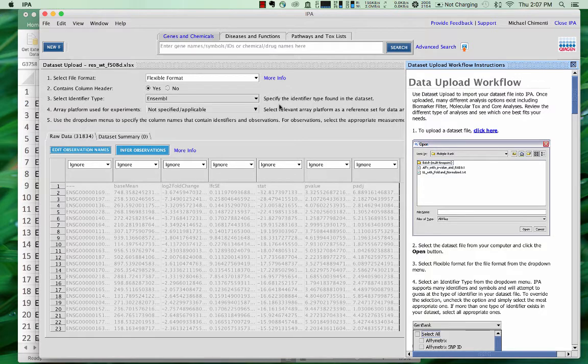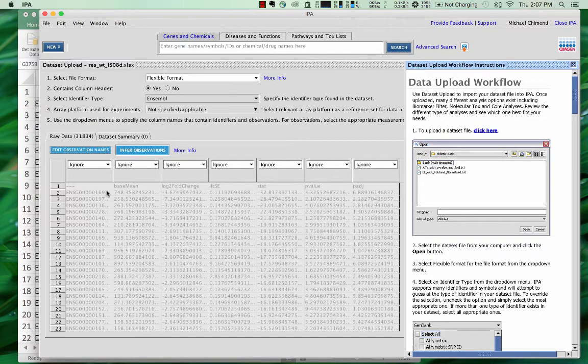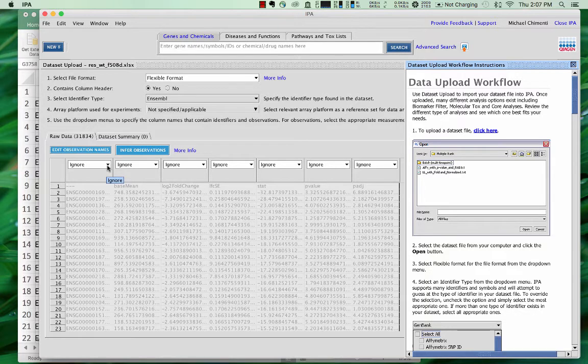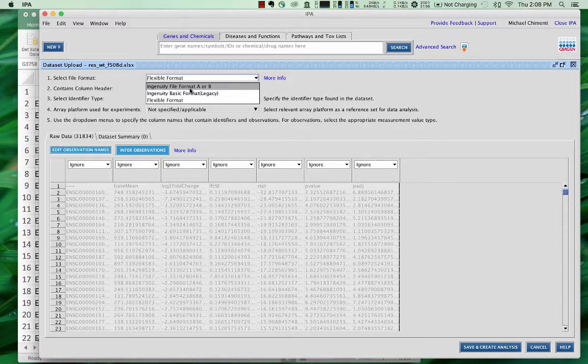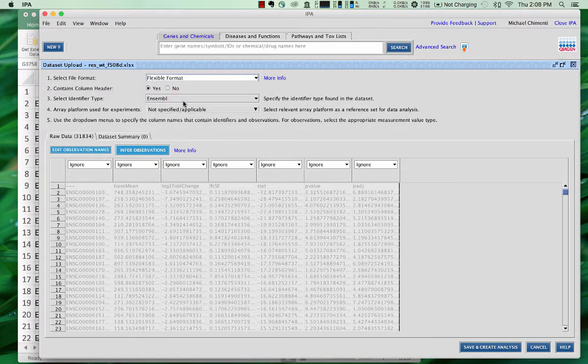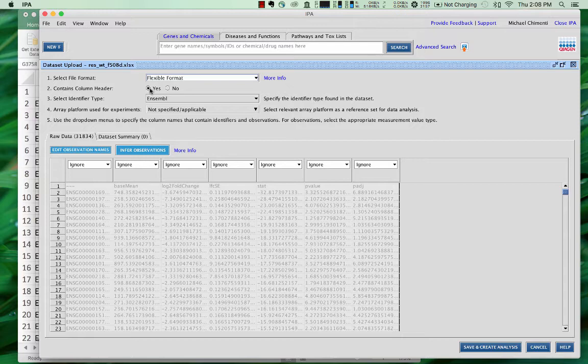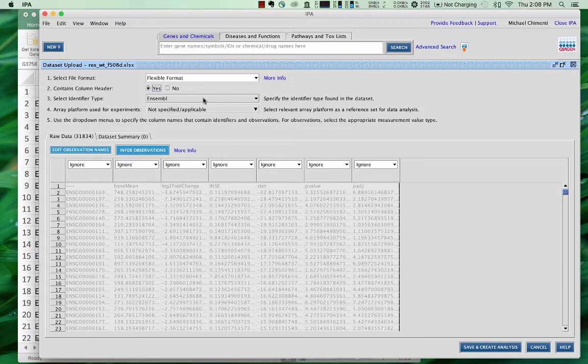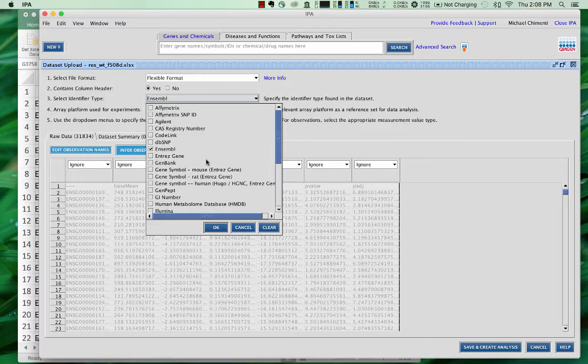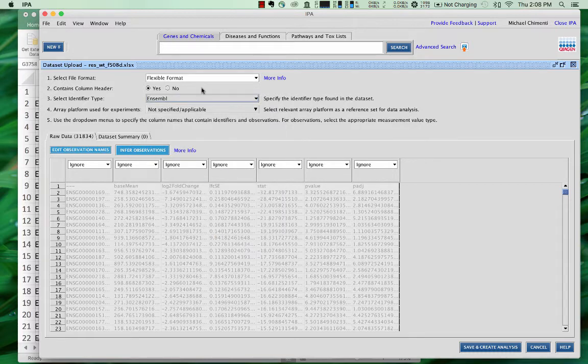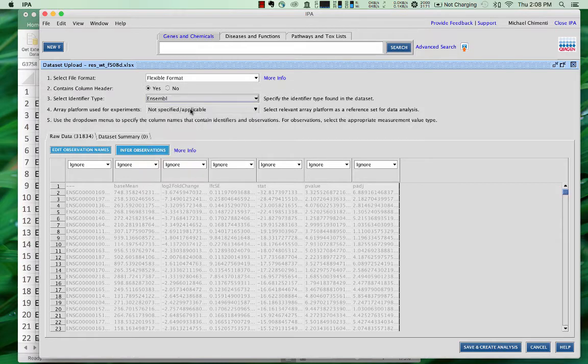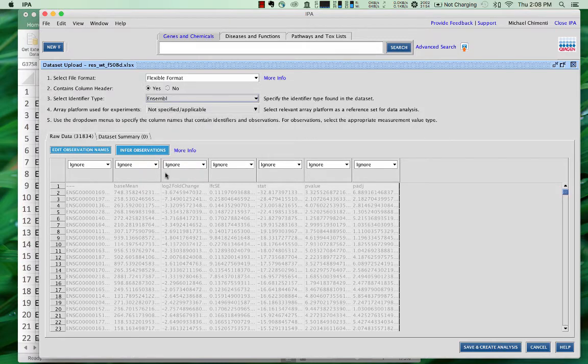Now, we get this dialog screen here, and the first thing to do is to look up here where we have a choice between the ingenuity file formats or a flexible format. So we want to select flexible format. In this case, the data does have a column header, so we'll say yes. It tries to guess the type of ID for you. So it got this correct. These are ensemble IDs, so we'll leave that as it is, and we'll leave this as not specified. This is the array platform, but this is RNA-seq data, so we'll say not applicable.